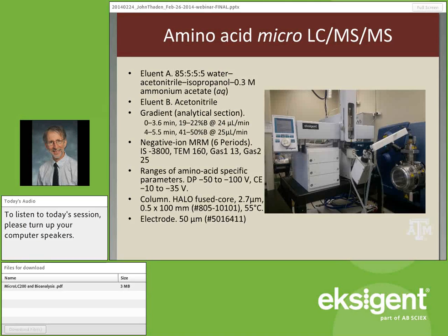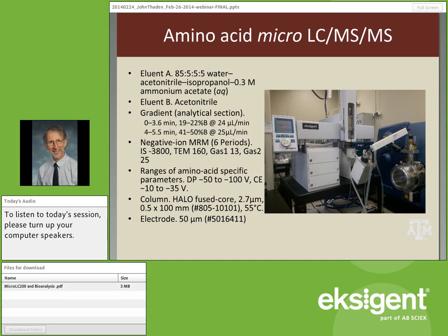Here is a picture of our equipment. We have the Exigent micro-LC — behind it is an older previous-generation version, both quite usable. To the right is an AB Sciex QTRAP 5500 quadrupole/linear ion trap mass spectrometer. We prefer to have the LC and MS separate because we can move them using audio-visual carts to wherever needed. If there's system downtime, we simply move the older mass spectrometer over and continue.